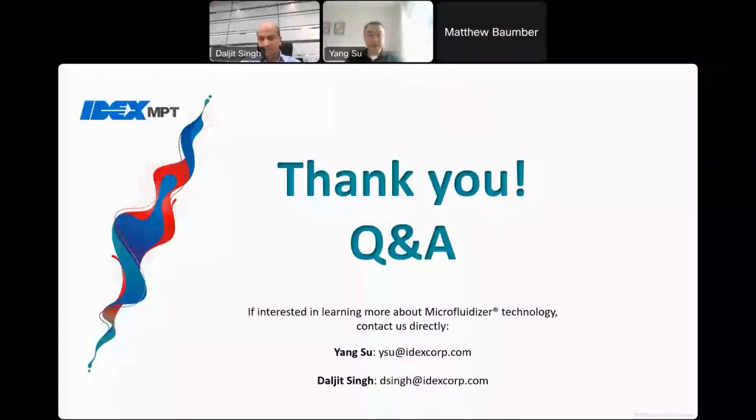Pressure is one of them, and it is an important parameter, because it will affect the shear rate produced in the microchannel. We also have, as I mentioned, different types of interaction chambers that can be used for different applications. The dimension of the microchannels is another parameter, as we have different designs with different channel dimensions for different interaction chambers. With the combination of that, we would be able to pinpoint the desired shear rate that produces the desired particle size. And there are a few other parameters that can be considered during the process.